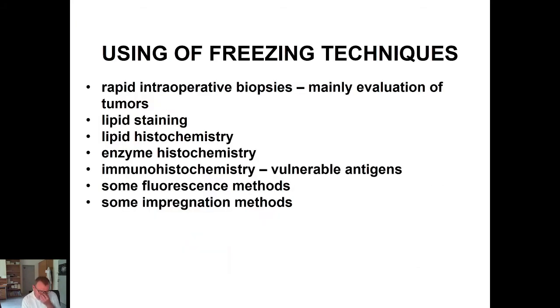Why do we use cryostats or freezing microtomes and the whole freezing techniques or cryotechniques also? The most important reason is that these methods are very fast.